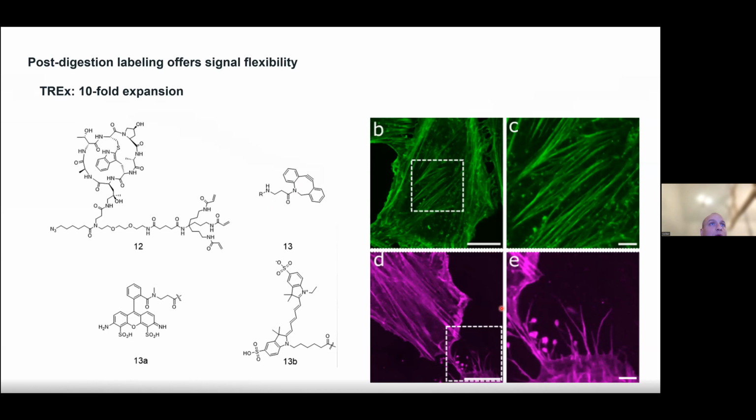We also have for the actin systems where there is a reactive group, as seen here. This is again the azide. Back to our design, we have phalloidin. We have groups capable of linking to the acrylate, and we have the azide here capable of linking to a cyclooctyne dye. So what you do is you start by incubating your sample with this reagent.